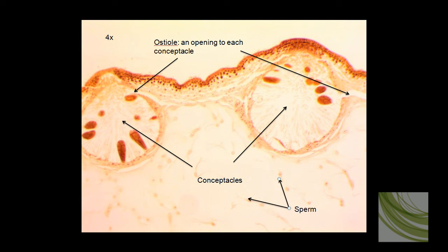Within these concepticles, we can see the female archegonium filled with eggs, and we can see in this slide very well some sperm, and they are scattered throughout this area.